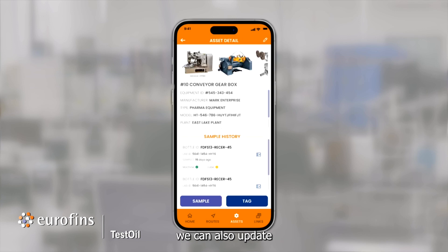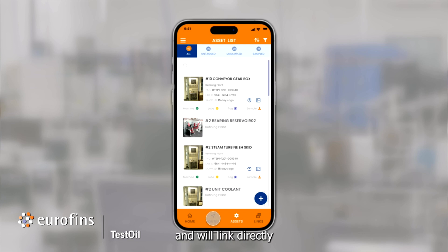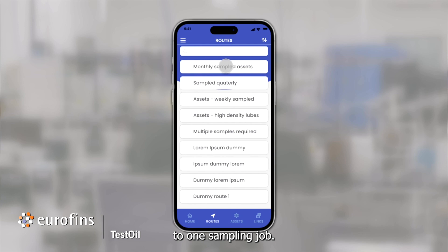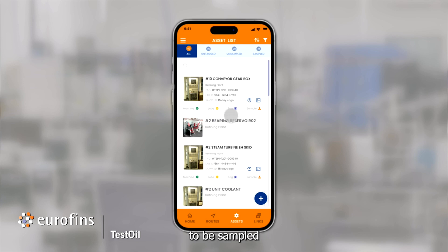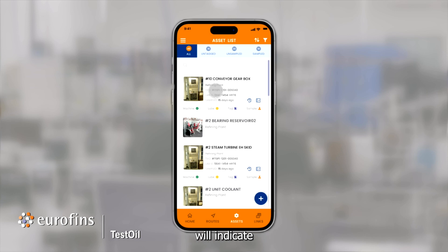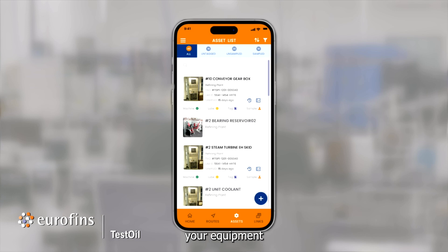From the Asset page, we can also update the equipment tag, as well as add a sample. Different equipment requirements and operational schedules can necessitate different sampling schedules. That's why we created the Routes function. Routes can be populated on your data site program portal and will link directly to your AssetLink account. Routes are groups of equipment specific to one sampling job. Selecting a route, then selecting Continue, will display a user-specified list of equipment assets to be sampled in a single job, perhaps in the specific order listed — consider this a work list. This list of assets will indicate whether or not a piece of equipment has been sampled. Selecting the asset will bring us back to the Asset Detail page for that piece of equipment. From the Asset page, we can also add new equipment, although we recommend pre-registering your equipment through your data site program portal, or by contacting us directly, before linking a sample.